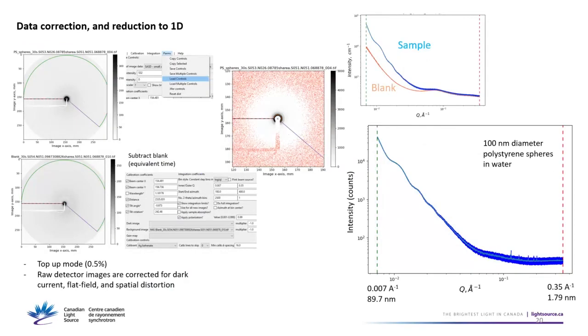Okay, so then there are some corrections you have to do to the data.